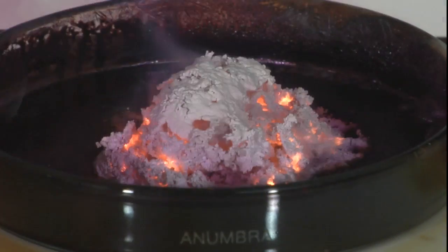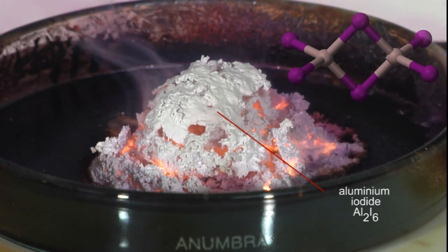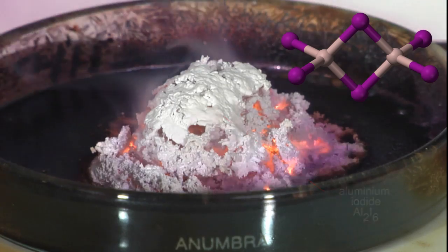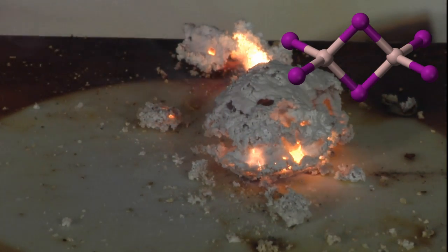White aluminium iodide is the product of the reaction. Aluminium iodide is composed of dimeric molecules with the molecular formula Al2I6.